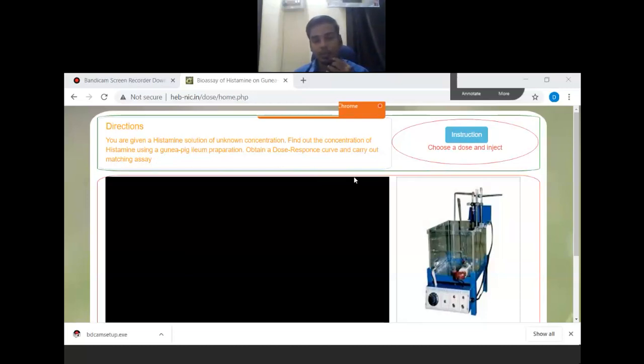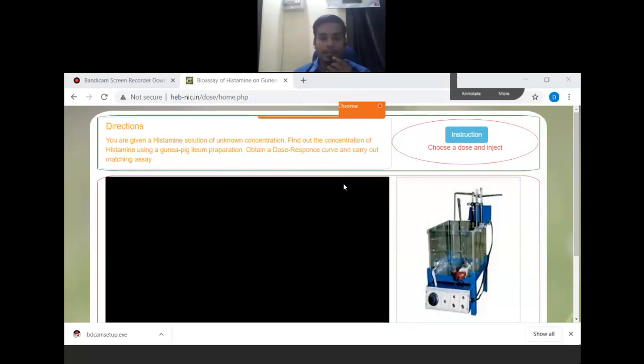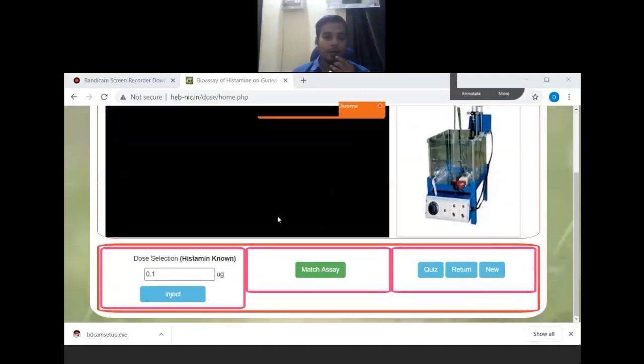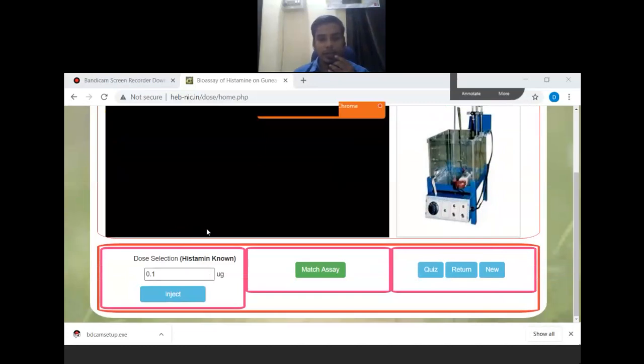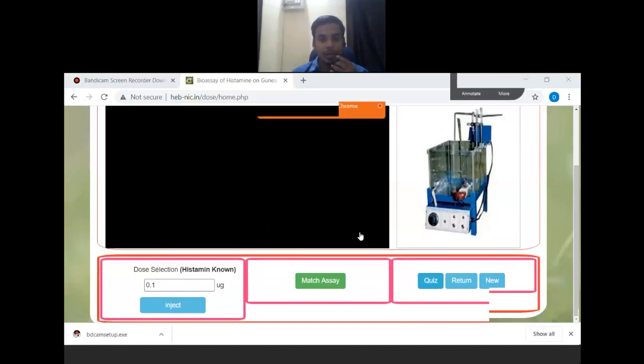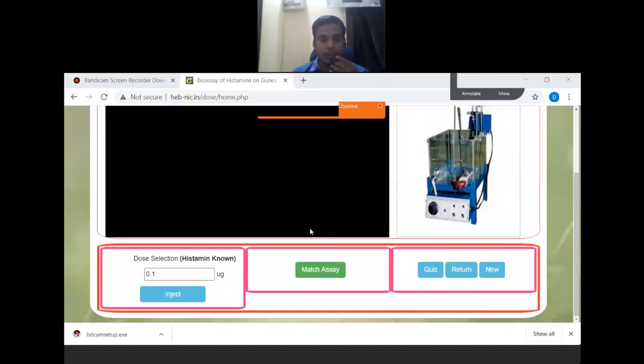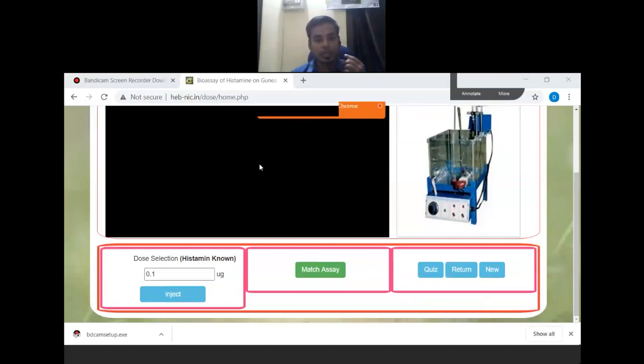Through this, we will be able to test. Below here, we can select the dose of Histamine at a normal concentration. In this kymograph, the dose as well as the response will be shown. Let us see here. The first dose 0.1, let us inject it.